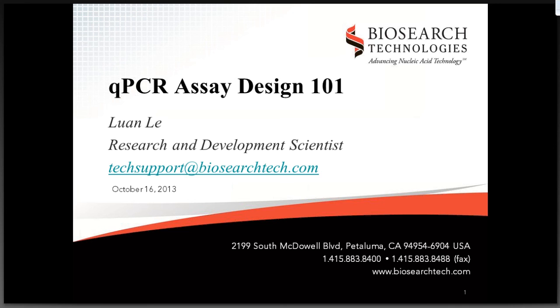Awesome. I'm just checking to see if there are any more questions to ask. We'll keep it to this last question here from Frank. How many BHQ or BHQ plus reactions can be multiplexed in one tube?